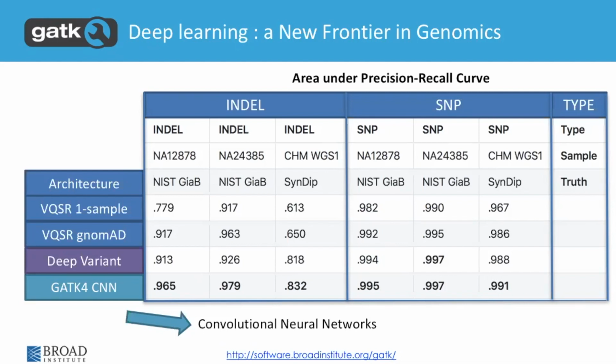This is the area under the precision recall curve. So it gives you an idea not just about one sensitivity and precision, but overall the whole spectrum of them.